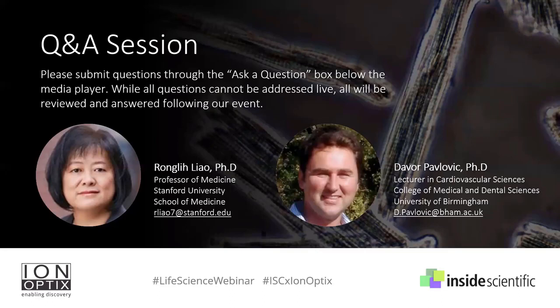So as a result of that, we compare the two techniques in terms of functional outputs. And once you get good cells out, the functional outputs are no different in terms of signaling, calcium transients, contractility, etc. Which technique is more likely to give you functional cardiac myocytes on a day-to-day basis? In our experience, the injection method tends to be a little bit more successful. But obviously, that potentially could be due to just good practice on that technique as well.